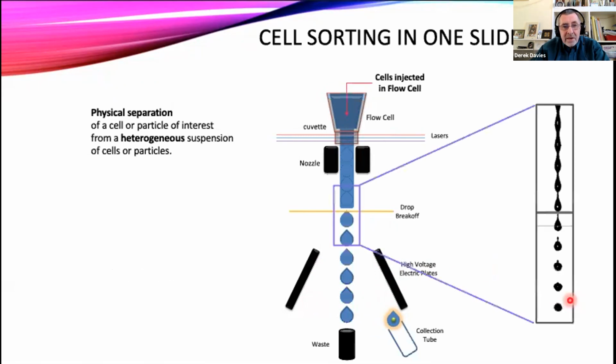And you'll be familiar, hopefully, from our previous webinars, with this sort of picture. This is what we're monitoring in the background when we're doing our cell sort. Here's our break-off point, so we have a camera focused on this. This is it in real time. Here's our column of fluid, and you can start to see it breaking up. It's undulating. It's starting to break up into droplets. And then here are our detached droplets.